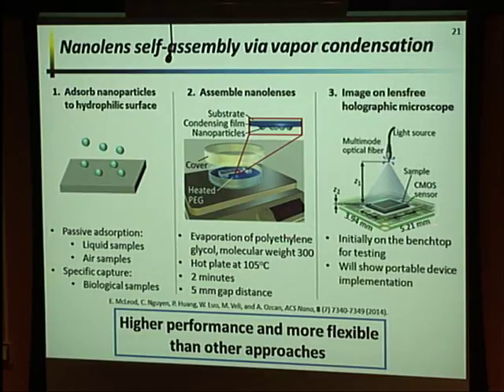Then we take our sample and put it on our lens-free holographic imager. Initially, we're going to do this on the benchtop, but in maybe about 10 or 15 minutes, I'll also show you a portable device where we combine these two steps together.